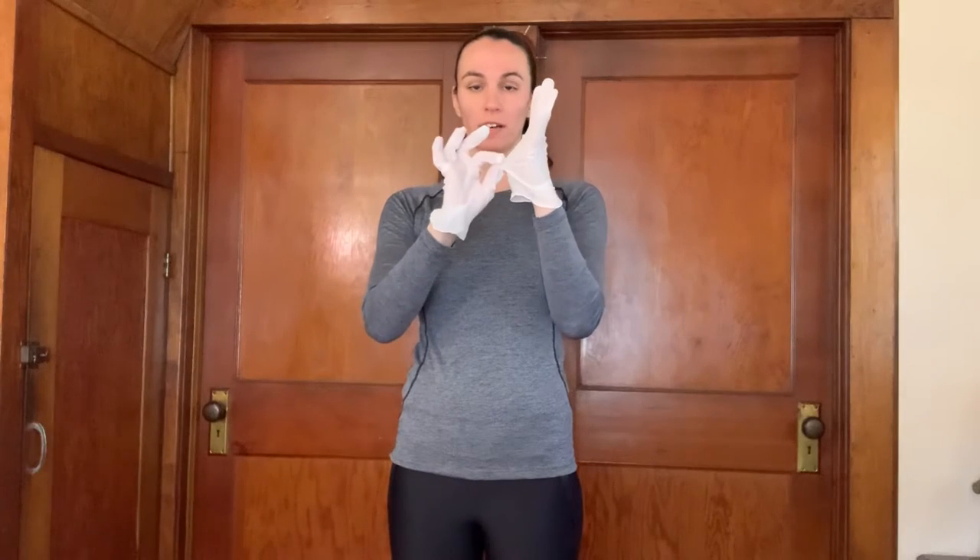So what you want to do is pinch the outside of one glove and pull the glove off. Then you can crumple it into a ball. Then you're gonna reach on the inside of your other glove.